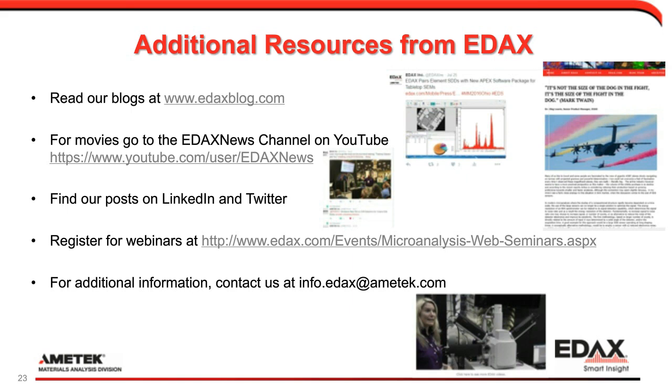If you really try to push the limits, there's a paper I like to reference by Nicholas Ritchie and Dale Newbury from NIST called Performing Elemental Microanalysis with High Accuracy and High Precision by Scanning Electron Microscope Silicon Drift Detector Energy Dispersive X-ray Spectrometry. Long title, but the point of it is that they can show there is a difference between a 1 micron diamond polish sample and then repolishing the same sample with 0.1 micron alumina polish. There is a slight change in the precision of the results.